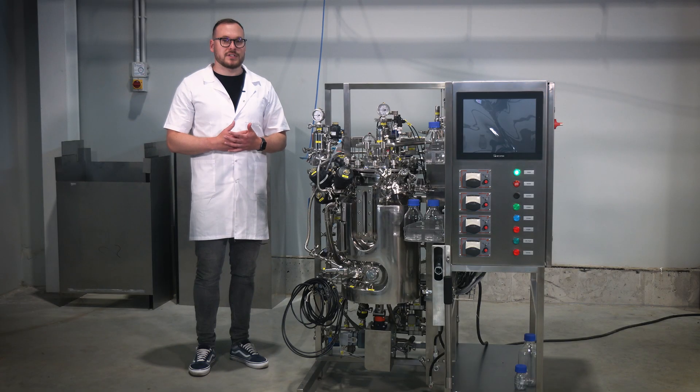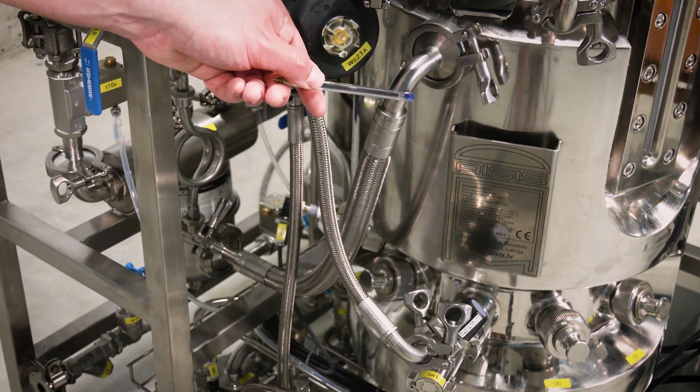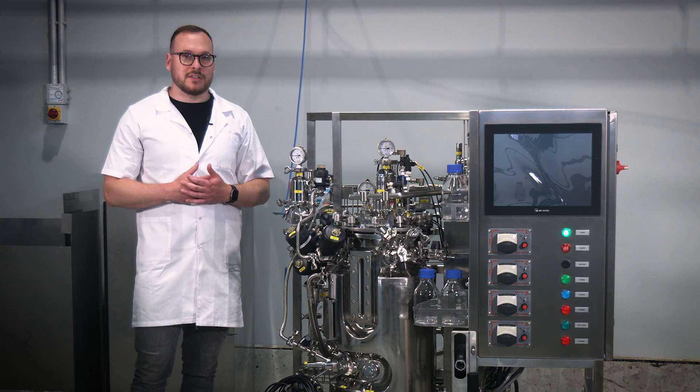Step 8. Using the supplied hoses and tri-clamp connections, connect the steam inlet water outlet from the heating jacket of the bioreactor to the technological skid and double check for proper alignment and attachment.